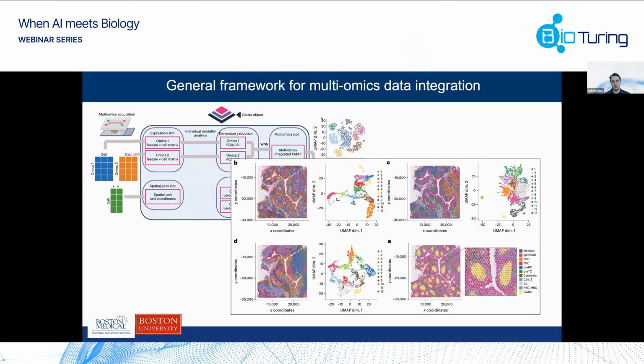We also show an example where we take it from the spatial angle. If you have multiple slides, one with transcriptome and another with proteins, and the alignment goes well down to the cell level, we can probably propagate the information between transcriptome and proteins. I think that is doable. Some people might argue that that's not really multiomics data and you might be looking at something else.